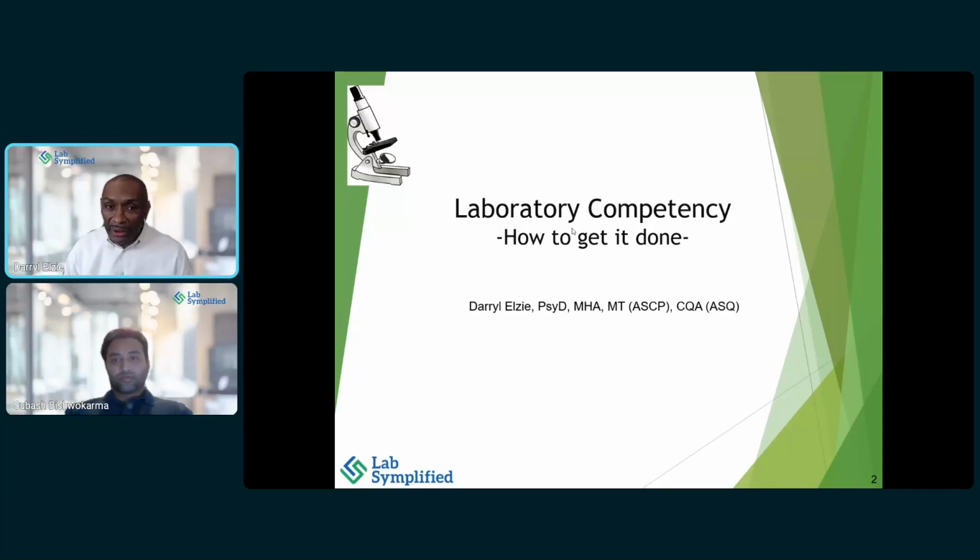As you mentioned earlier, across all 7 accrediting organizations, year after year, competency is the most frequently cited deficiency. As a matter of fact, last night I was teaching some ASCP international students, and we dealt with competency. It was surprising that on an international level, they're using those same CLIA 88 competency 6 elements as the basis for doing competency across laboratories around the world. That was surprising, and it is working for them also, but they also have the same type of challenges.